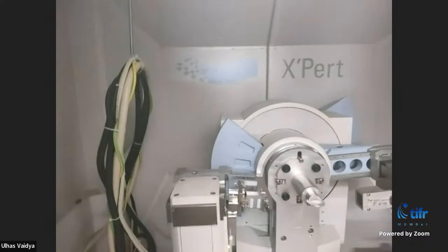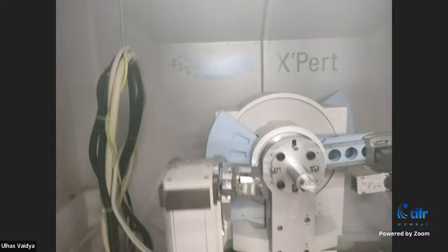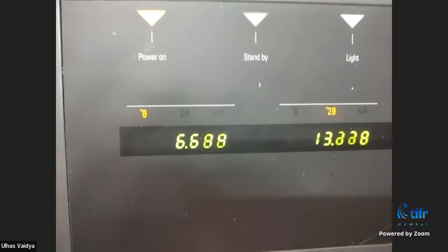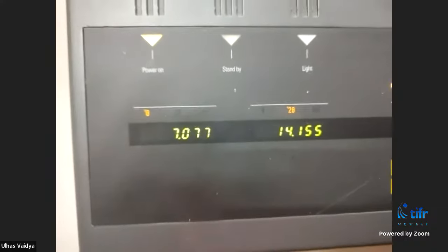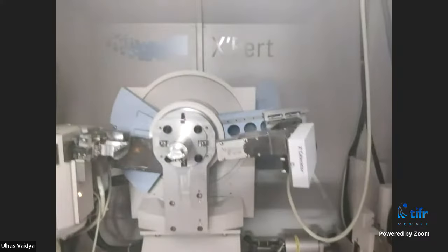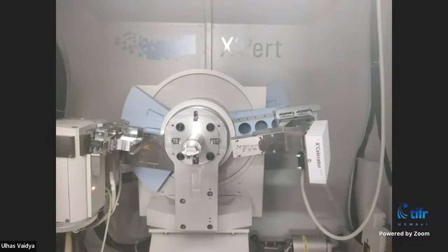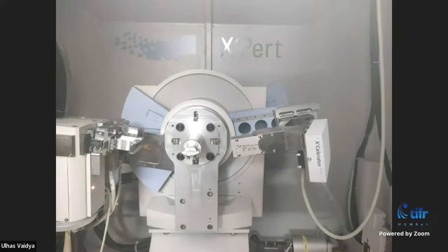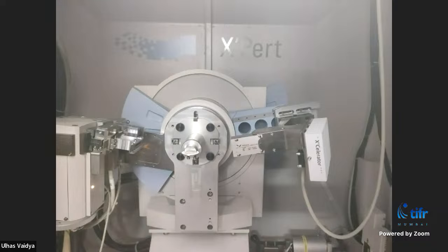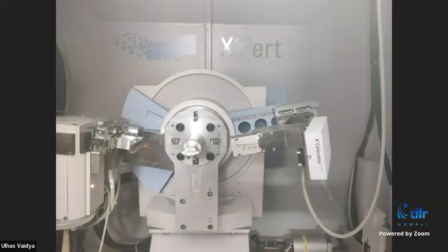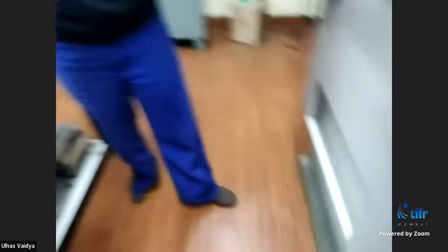The scan has reached from 10 to 70 degrees and there are no major peaks. You see only noise. There is a broad peak at 22 degrees, which is coming from the sample holder or some impurity from the crushed glass. So there are no major peaks — confirming this is an amorphous material. We will now see another sample which is crystalline: common salt, NaCl, which has a rock salt crystal structure.